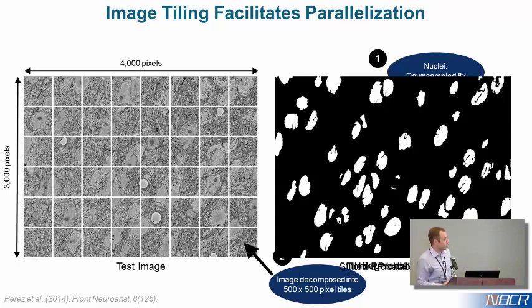But yeah, so those will drop out really easily once you say, okay, this is way too small or too irregularly shaped to be a nucleus, let's say. Did that answer the question? Okay.